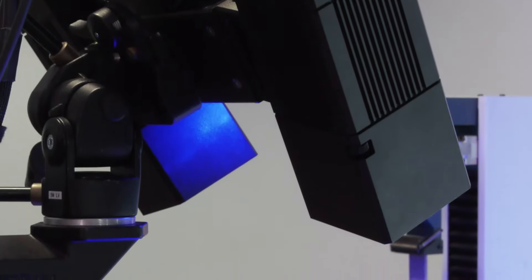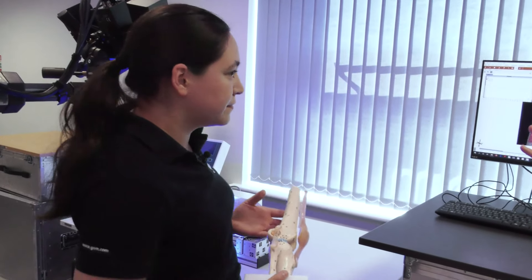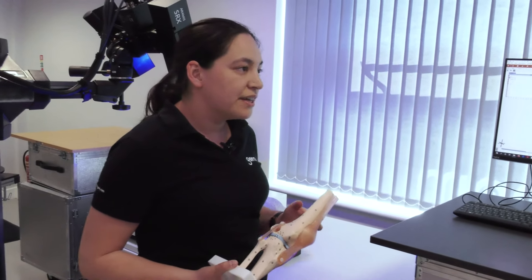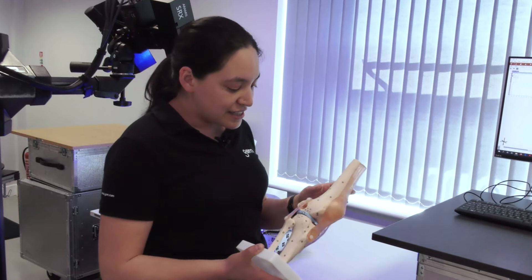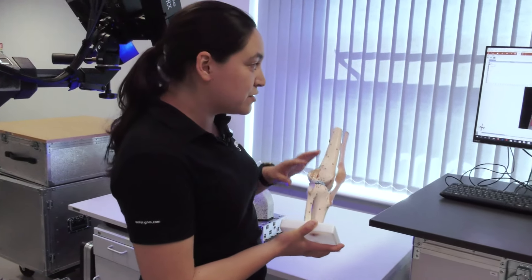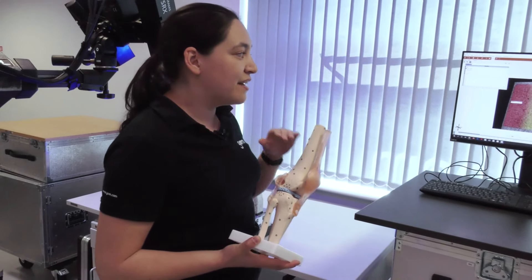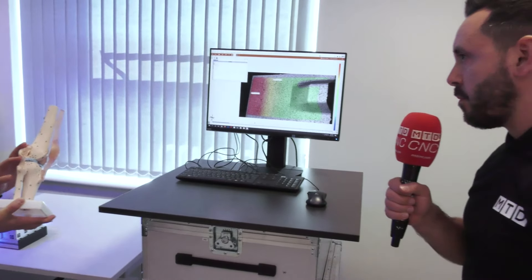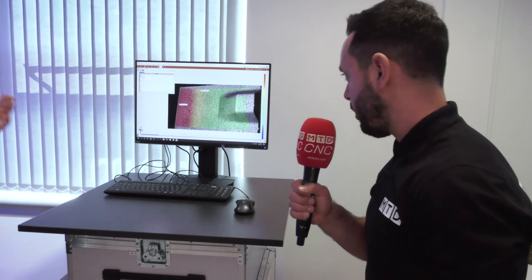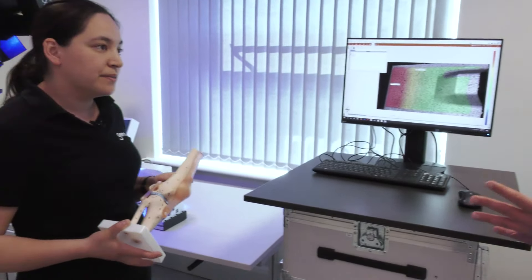We've got two cameras here so we can measure everything in 3D — essentially just getting the 3D coordinates of all the points or the speckle pattern. Then the software does all the clever work of translating that into six degrees of freedom measurements, displacements, and strain measurements.